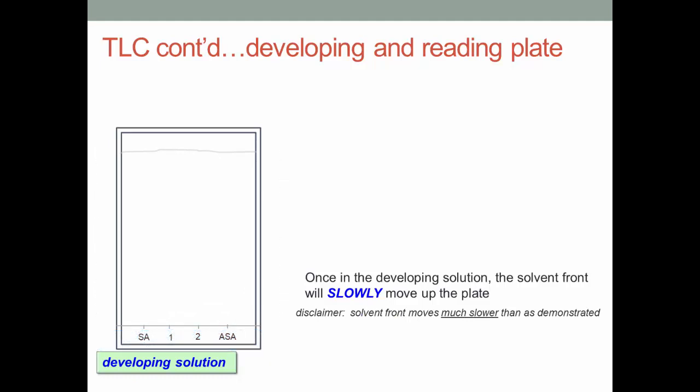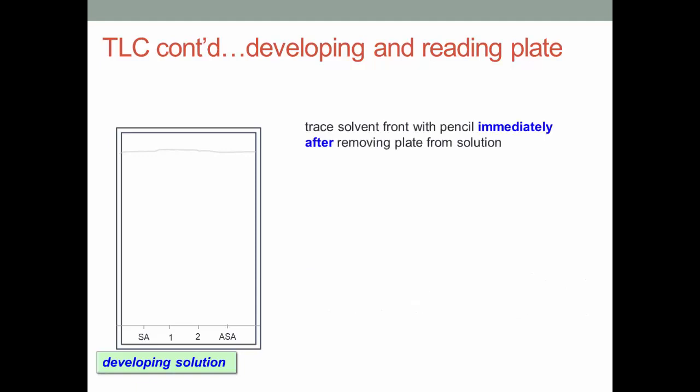Once the solvent front is within 1 cm of the top of the plate, remove it from the solution. Trace the solvent front with a pencil immediately after removing the plate from the solution. Then, allow the plate to completely dry in the fume hood.